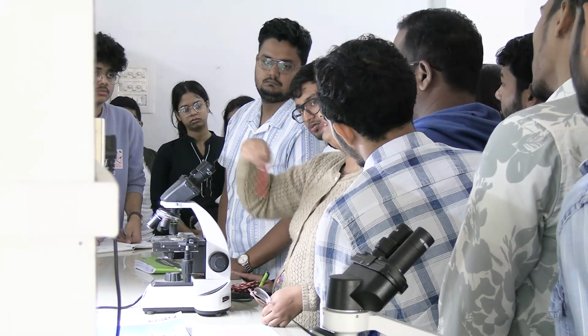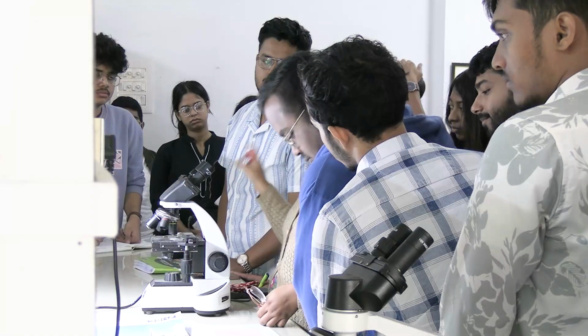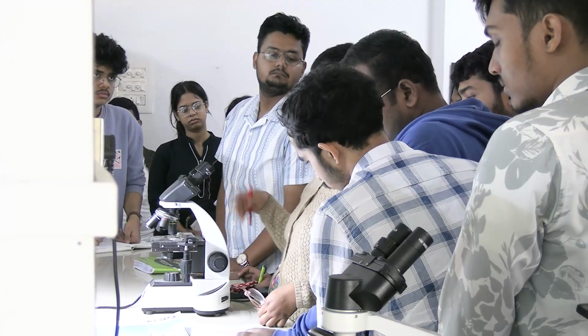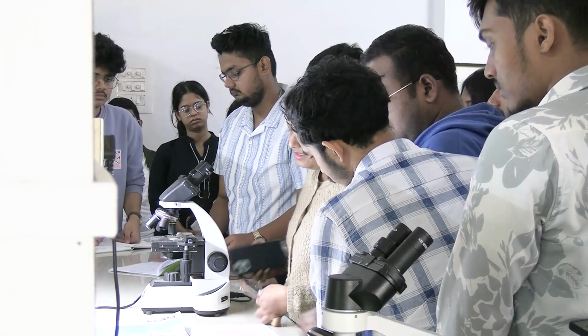It is formed by lymphocyte and you will see the nucleus of lymphocyte. Nucleus of lymphocyte is stained with hematoxylin blue. Okay, that's why it looks blue.